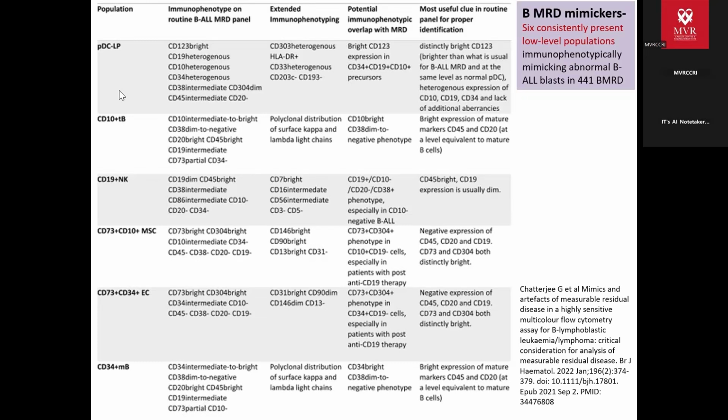Okay, and the manner of aspiration findings. And this is our MRD report, where we'll be mentioning which are the positive markers that we have seen in this abnormal blast. I've seen around dash percentage, I mean 0.1% of abnormal blast, which will be showing CD34 positive or 38 dim. So you can see what is the expression pattern of this blast in this table.